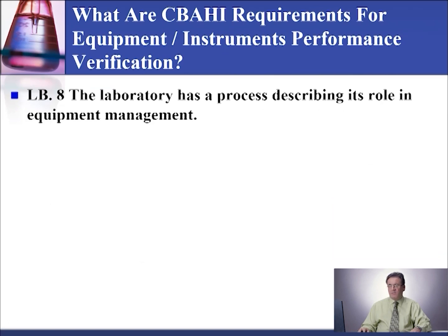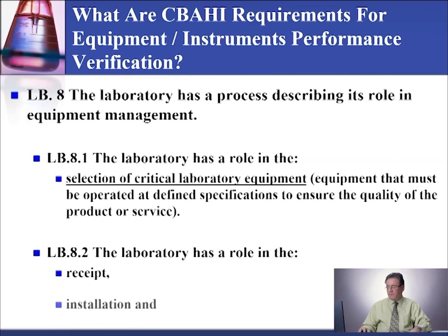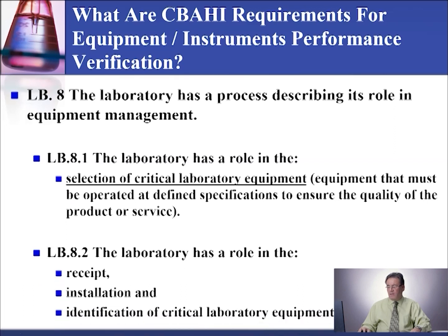If you recall, in lesson 2, we started talking about the CAB and CBAHI requirements for equipment instrument performance verification, and we covered design qualification and installation qualification. In this lecture, we will continue with that topic, and we will talk about operational qualification, OQ, and performance qualification, PQ.